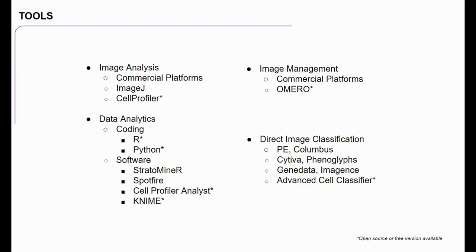As regards data analytics for the processing of the numeric data after you've done your feature extraction, when you look at these various papers and you get excited about doing that analysis, often you'll find that a lot of the work is done with coding in things like R and Python, and naturally you'll need someone who can actually do that to help you replicate some of that work. But you can also do things that are very similar to this using some other commercial and open source platforms.